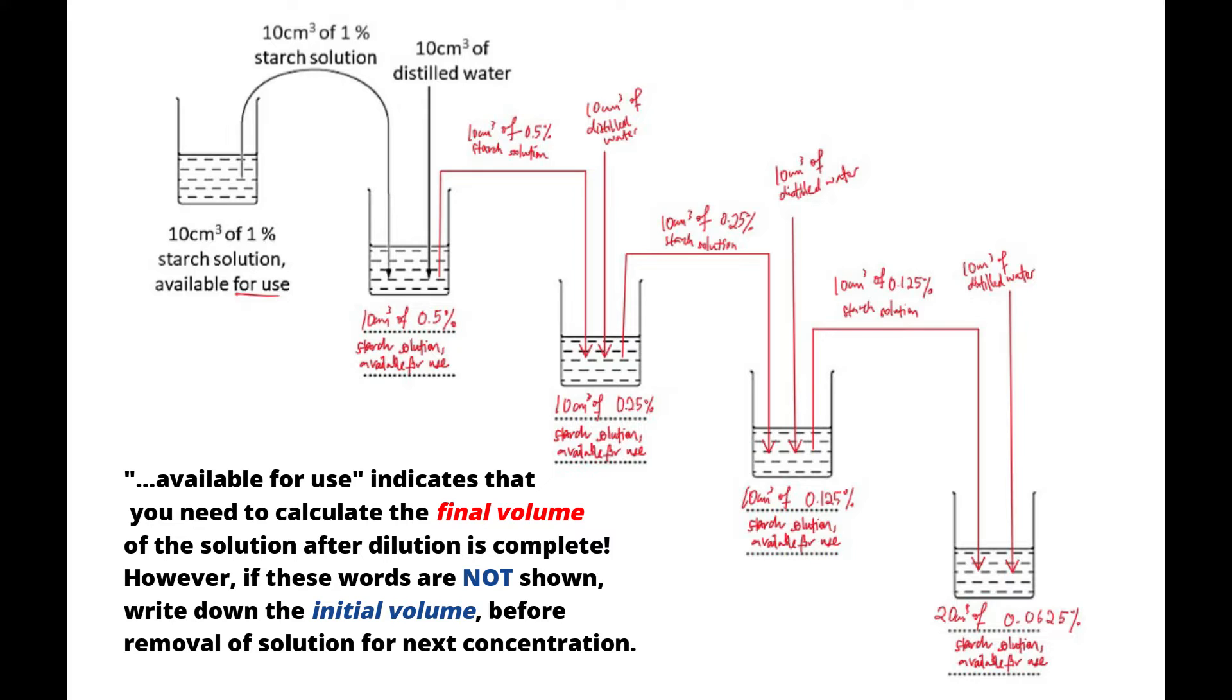This procedure is repeated for each consecutive concentration until 0.0625%. We can see here at the last beaker, because it's the final concentration, no more solution is removed from the beaker, and therefore, it's just 10 plus 10 cm³, and this results in 20 cm³ of 0.0625% starch solution available for use.